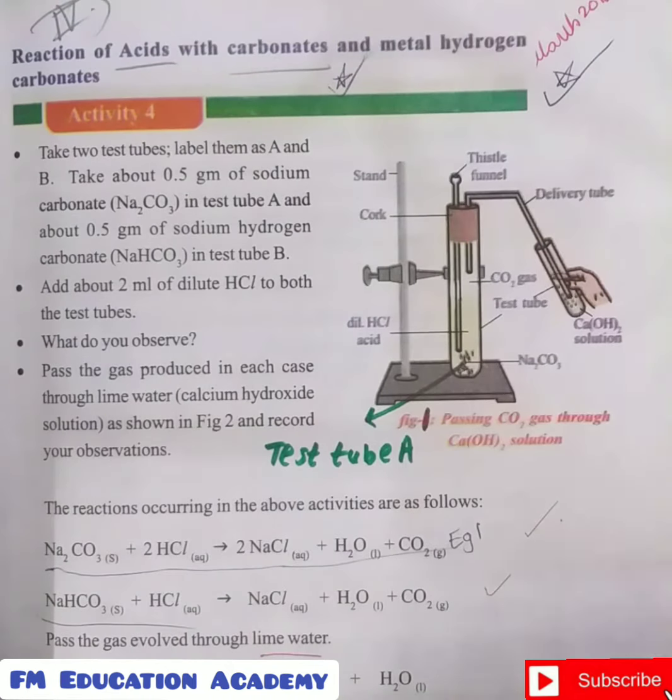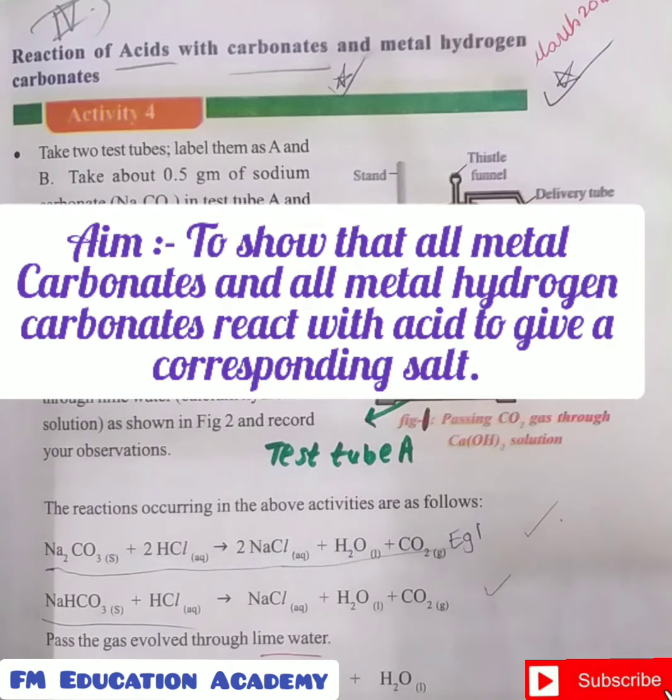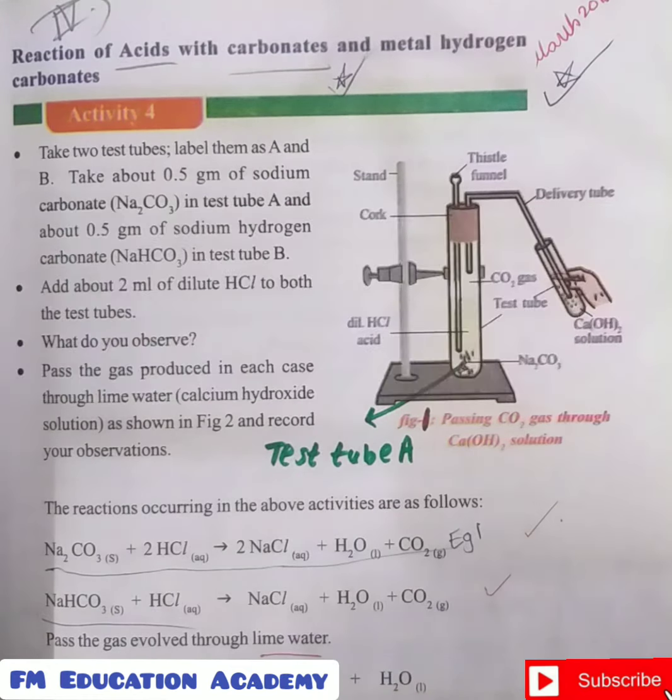What is the aim of this experiment? To show that all metal carbonates and all metal hydrogen carbonates react with acid to give a corresponding salt. So here also on the product side, whenever acid reacts with a metal carbonate or a metal hydrogen carbonate, a salt is formed.